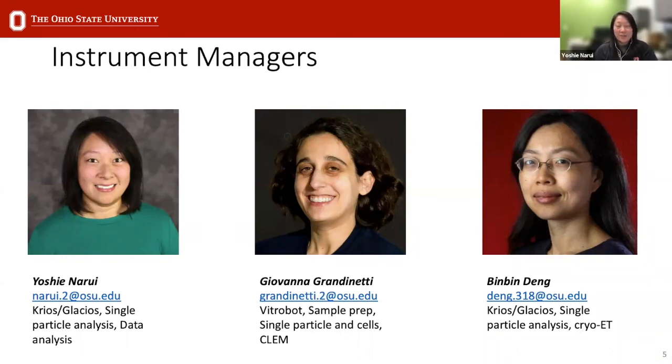We obviously want your project to be as successful as possible. I tried to put in this presentation things that would help make it go as smoothly as possible. But really, we would love to hear from you. I talked about single particle samples, but if you have samples that you're interested in doing, for example, cryo-FIB or micro-ED, those are also techniques that we have available here. So please reach out and we will put you in contact with the right people.